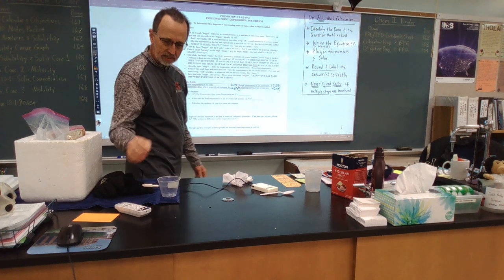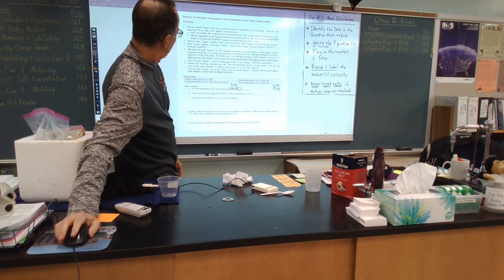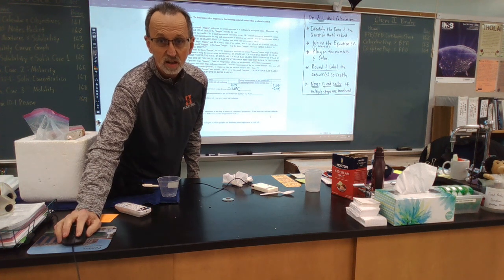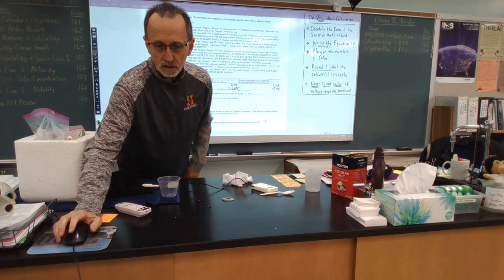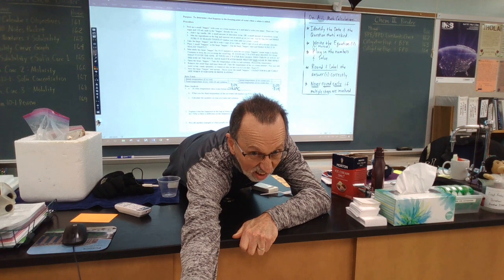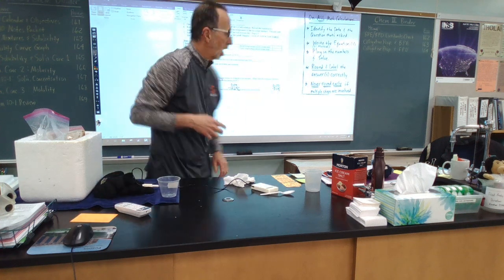All right. I'm not quite ready to eat my ice cream yet, although it sure is tempting. I want to talk to you about the calculations here a little bit. So, let's see here if I can scoot this down. Sorry about that. Got to lean over here. Well, that didn't do what I wanted it to do. There we go. That's better.